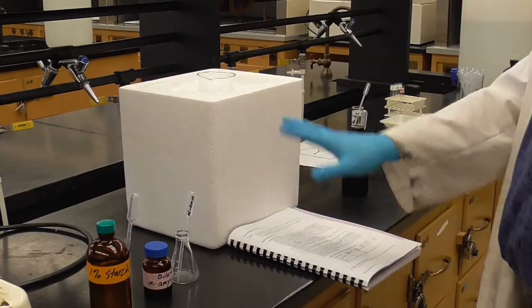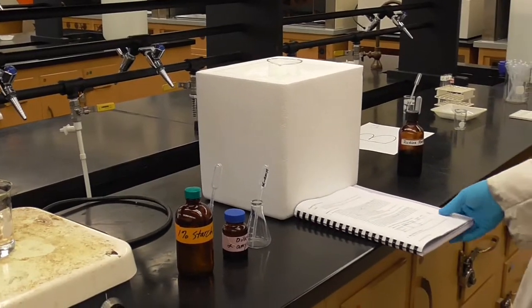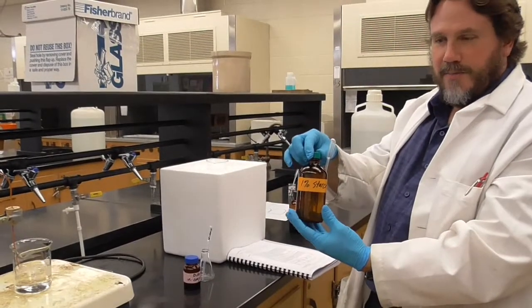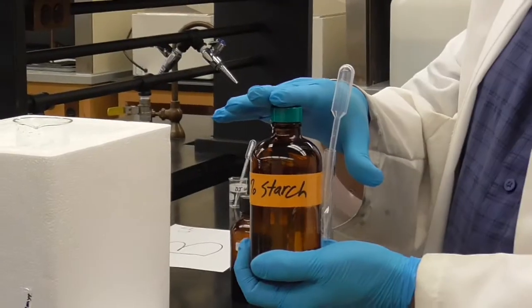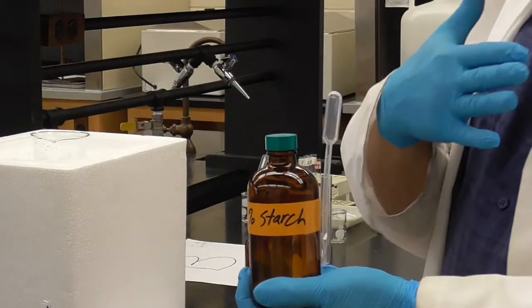Okay, step 2. So we've got our bath set up. Step 2 says get the 1% starch solution. So we have that made up here. It's ready to go. 1% starch. Okay. So again, this is the reactant of the reaction. This is the complex carbohydrate that will be broken down.